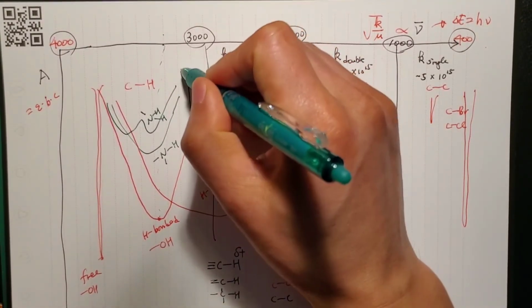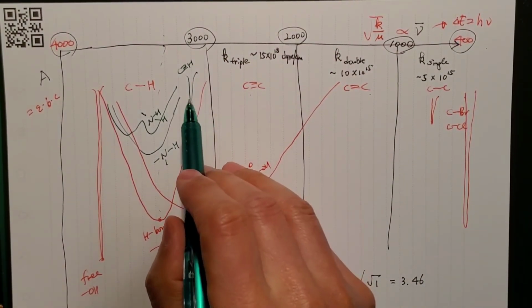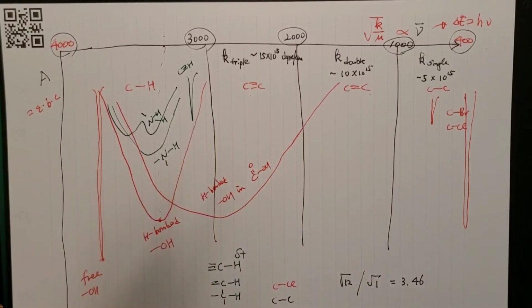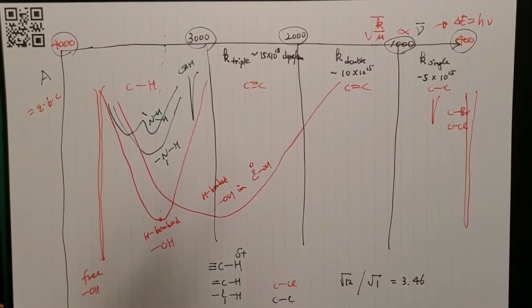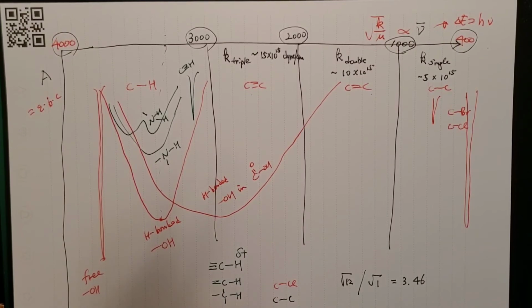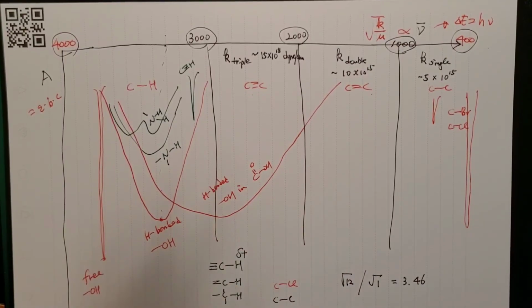So when this is a triple-bonded hydrogen, I don't want to say this is always weaker, so it should be smaller than that. That's useless, because unless you have an sp carbon and an sp2 carbon together, ordering them is not useful at all. Even when you have them together, I don't want to order them by sp2, because again, it depends on the neighboring group of the particular bond, the triple bond or the double bond.